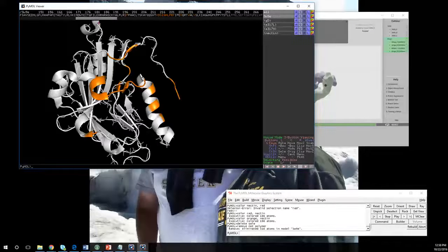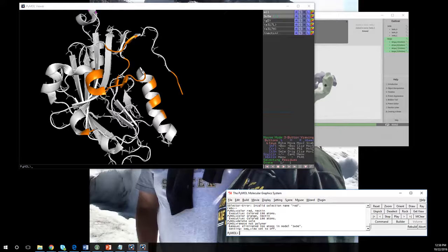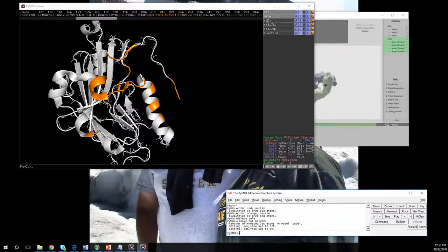Well, that'll be my first little tutorial on PyMOL. A couple of points that you're going to want to remember. Using this area right here, you can color and do all sorts of other things. I can also use the command line to pull everything in. Don't forget to set your display so you can see the sequence. That is very handy a lot of times if you're trying to identify specific residues. You know that this 131 is important, and whatever point from the primary sequence is important, you can see it. So anyway, that's a command. I'll do more later. Enjoy.